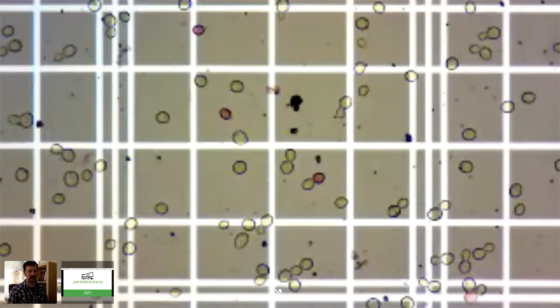But if you're moving pretty fast on your yeast, you should be able to be within 70 to 85% viability at a homebrew level. On a pro level, you can probably get it higher because you have a lot more control and stuff like that.